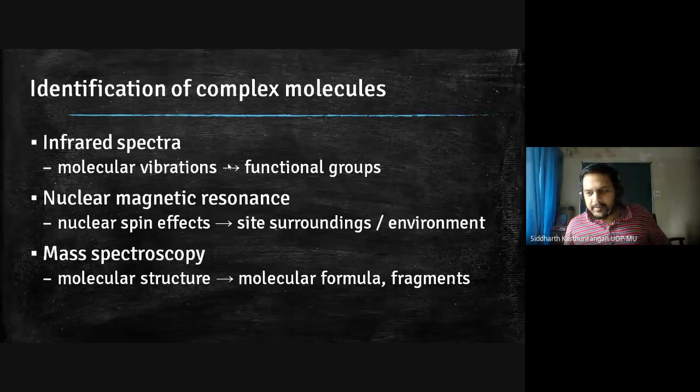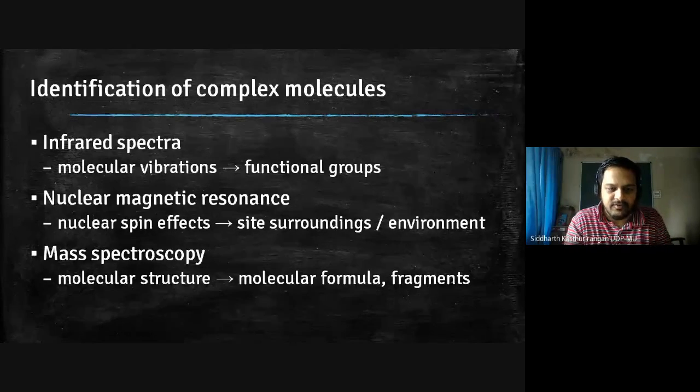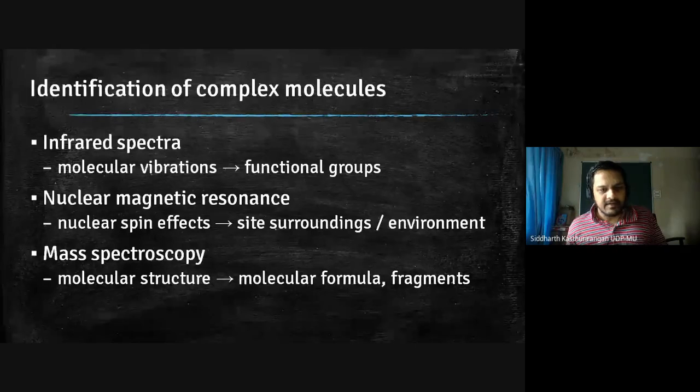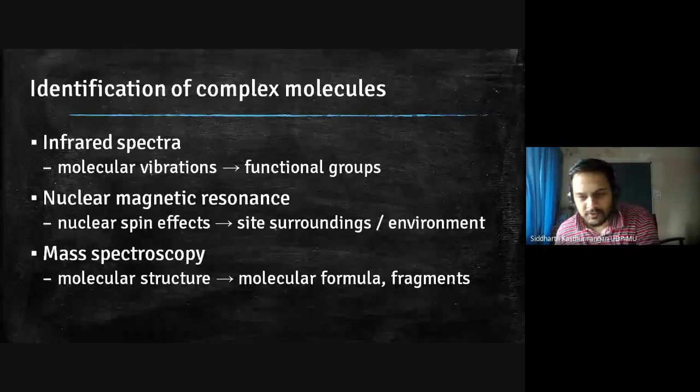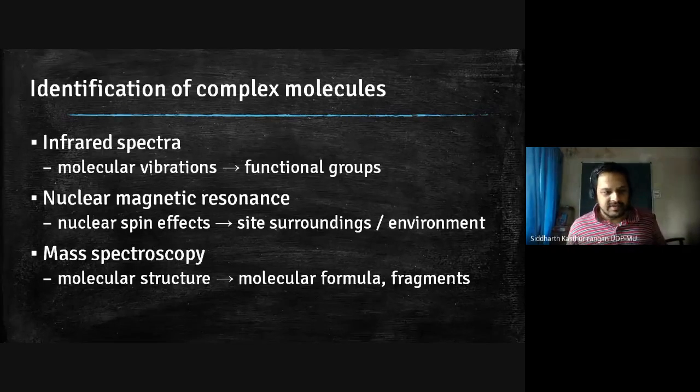features. Like suppose you want to make a map of India. One of the things is you go and from a satellite you take the full picture of India and then you get a map. But infrared spectrum is more like you will see Qutub Minar, you will see Taj Mahal, you will see Gol Gumbaz, you will see Ashoka Stambh, you will see various Gateway of India. So it gives you specific features, and by looking at those specific features, you have to zero in.